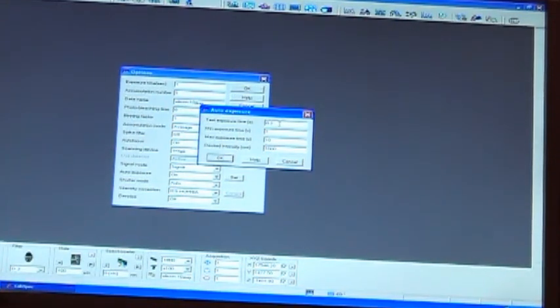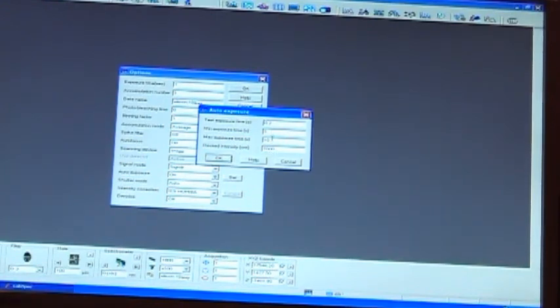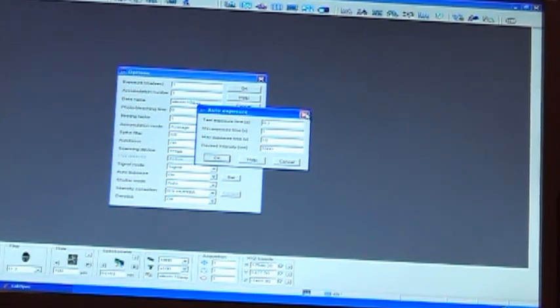So it'll take a quick 0.2 scan right now to just see what kind of data it gets. Then it would try 1 second first as the minimum time, and at 1 second, if your signal is 1,000 counts or higher, it'll stop and say we are done. If not, it'll keep trying to a maximum of a 10-second length exposure in order to get you a maximum signal of 1,000 CPS. This does not adjust the focus, position, or anything. It automatically adjusts the acquisition time. If you don't want to do this, you can always just try it manually and look at the data yourself if you're sitting there. But these are all the auto features.